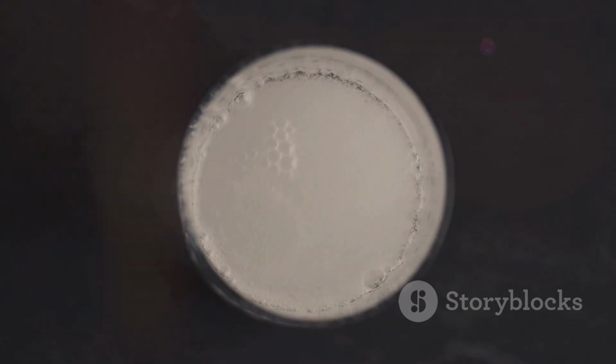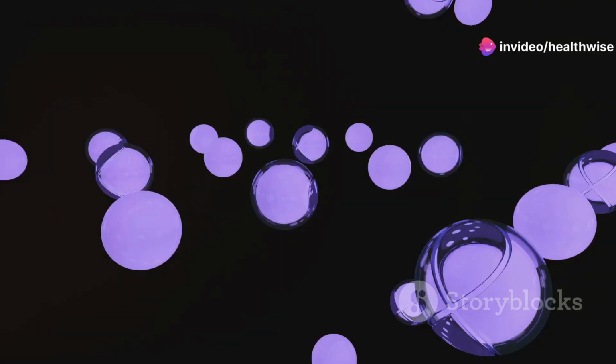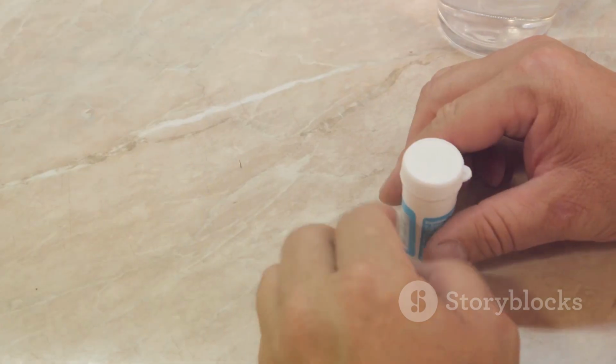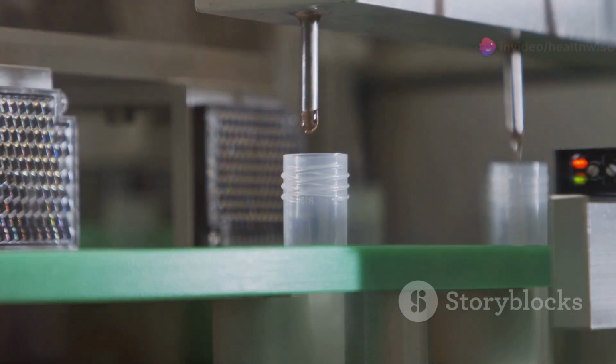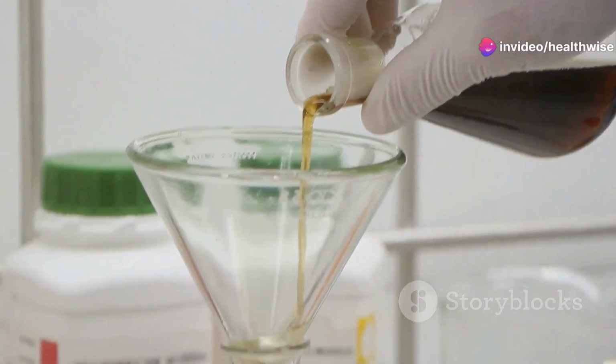In TLC, the stationary phase is a thin layer of material like silica gel adhered to a plate. The mobile phase, usually a solvent, moves up the plate by capillary action. Here's how it works. You apply a spot of your sample near the bottom edge of the plate. Then, you place the bottom edge in a reservoir of solvent. As the solvent moves up the plate, it carries the sample with it.